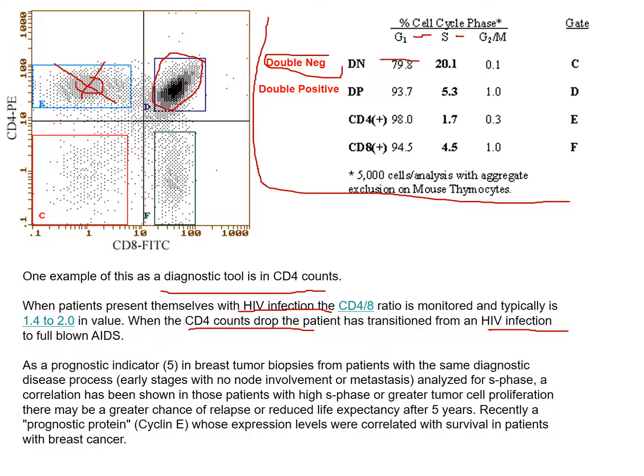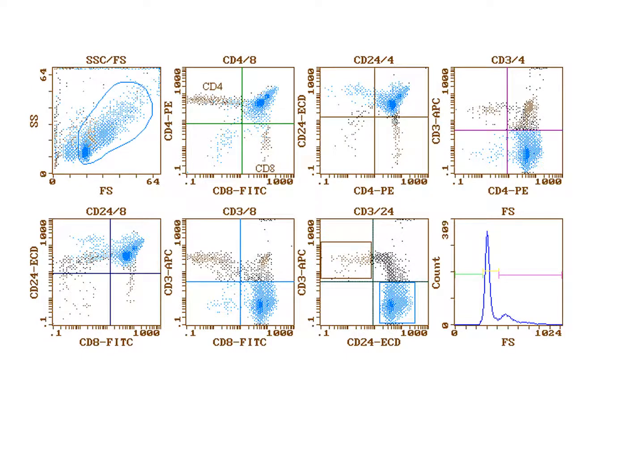They're sitting in S a lot more than these other guys, which is interesting. Not sure what that means, but it is interesting data. So you can expand the FACS into many different parameters, 12, 15 if you have a sophisticated enough machine, and you can compare.